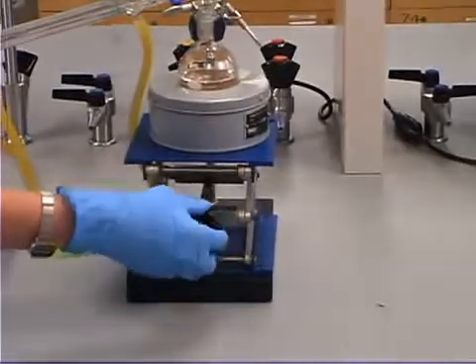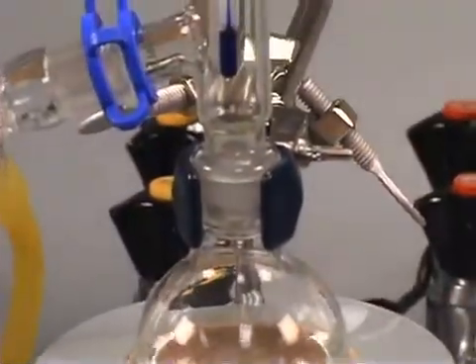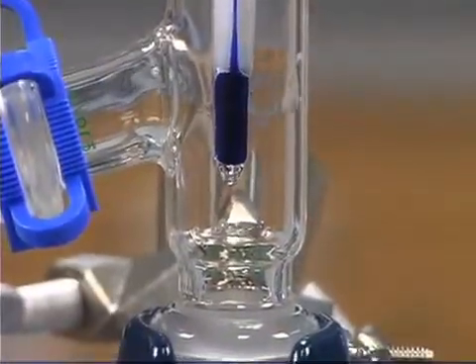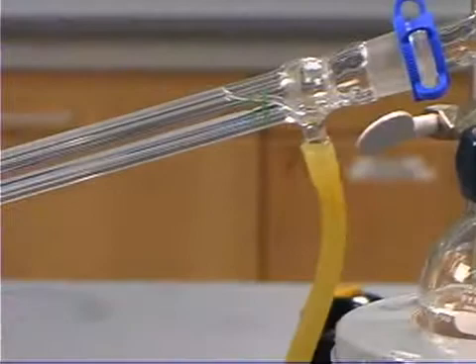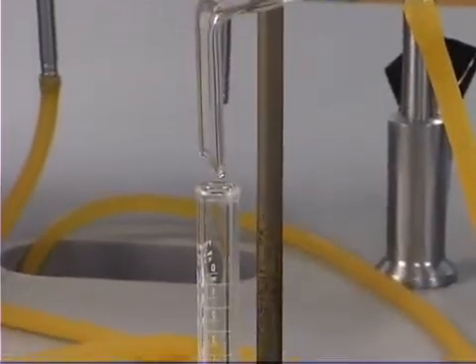To begin distillation, raise the heating mantle up to the round bottom flask. Temperature and rate of distillation are exclusively controlled by raising or lowering the heating mantle. Monitor the temperature and collect the distillate in several fractions.